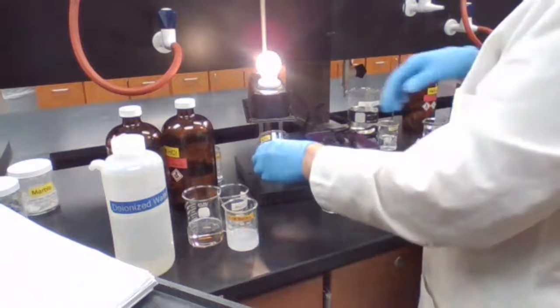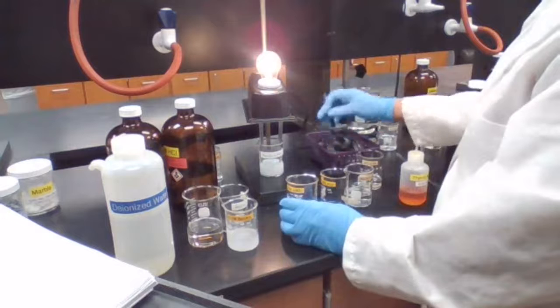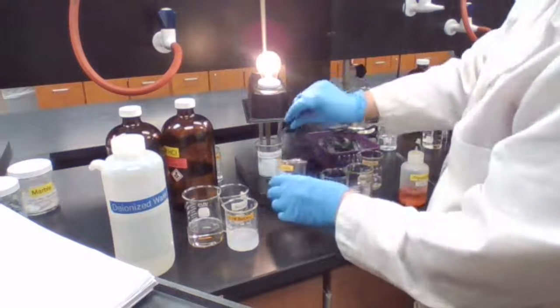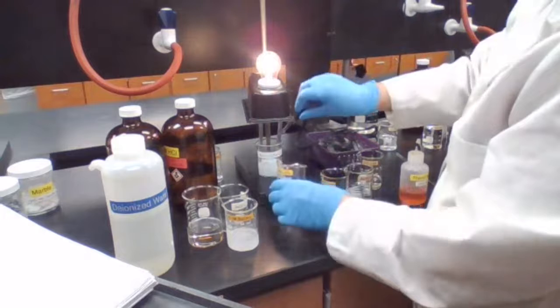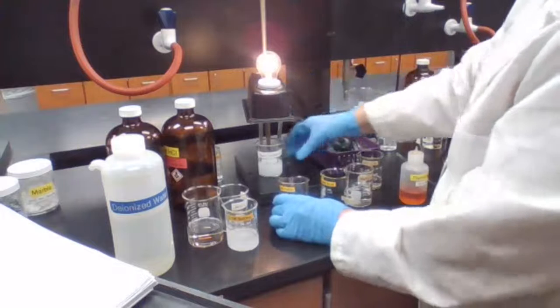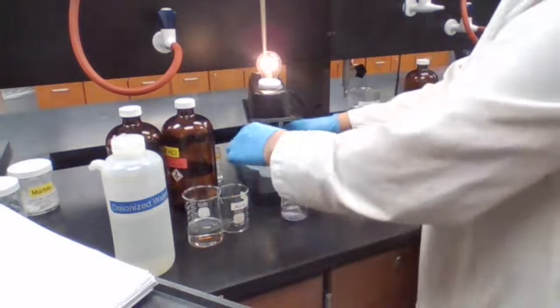See what's happening to the light? If I add enough sulfuric acid to react with all of the barium hydroxide, then the light is going to be dim and dimmer.